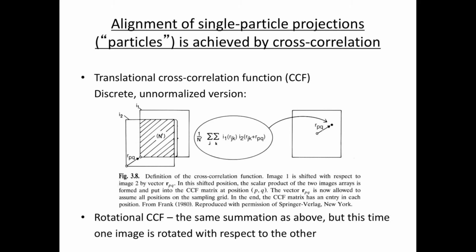Now the computer is dumb, doesn't know where the peak is, so the peak needs to be searched. The computer has to go through this line by line and find out where is a point that is larger than all the other points that have already been encountered. So it has to scan through and find this place. All right. So this is how cross correlation works.